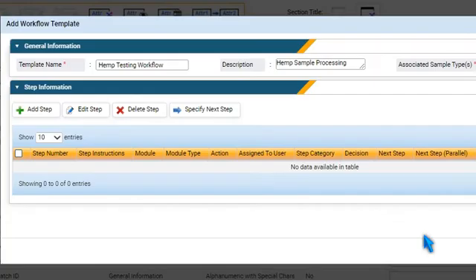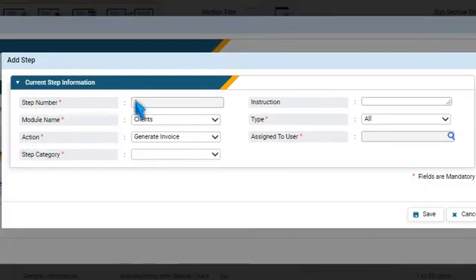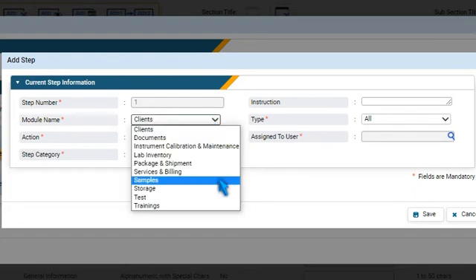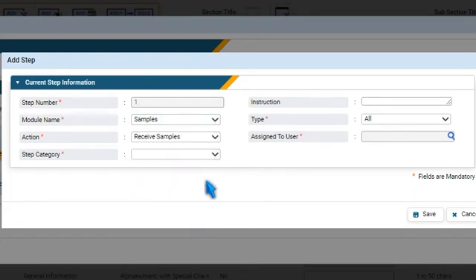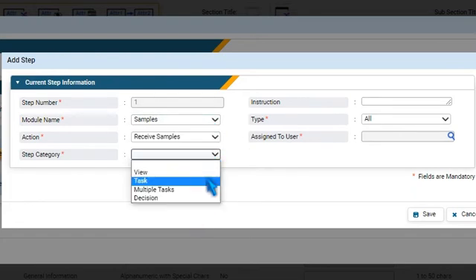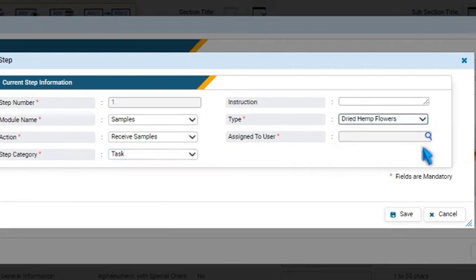To add steps to the workflow, press Add Step. A step number is assigned automatically to each step. Select a module, an action item, step subcategory, a type, and specify instructions, if any.